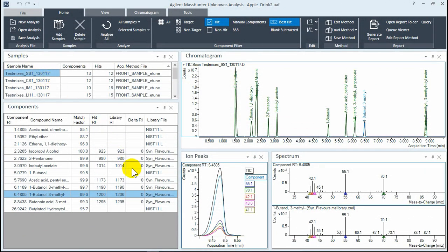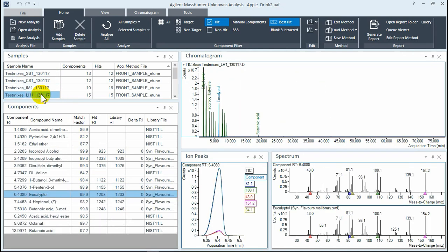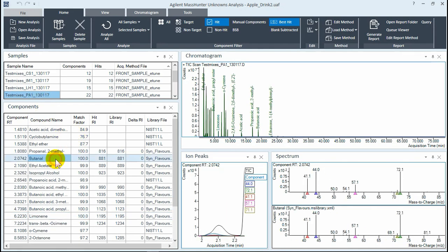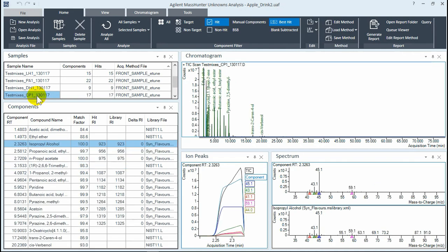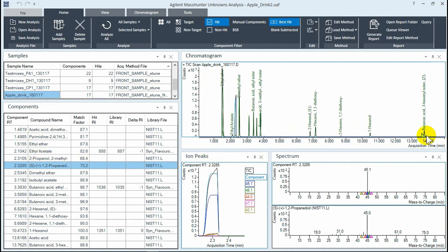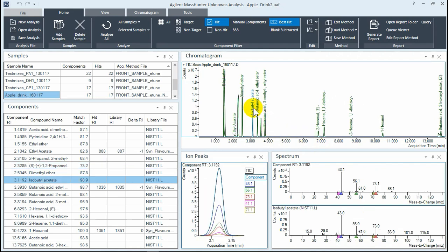Okay, let's take a look through this data. We've got a number of test mixtures, and you can see how they have found entries in the flavors library. You can also see how useful it is to use retention indices, which gives you that independence and identification by retention time, or even the ability to reduce false positives by making a retention time window using RI as an independent mechanism to calibrate against a known ladder.